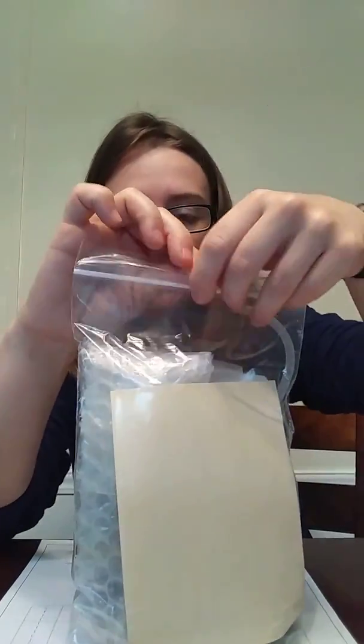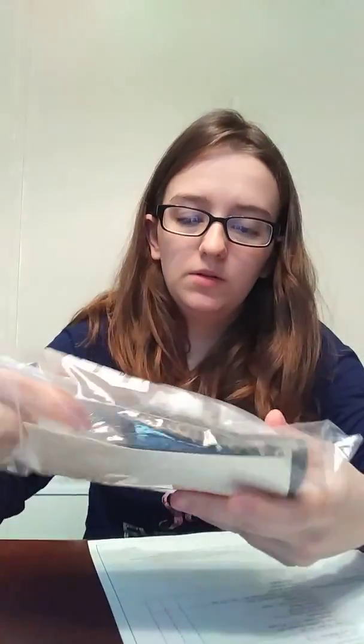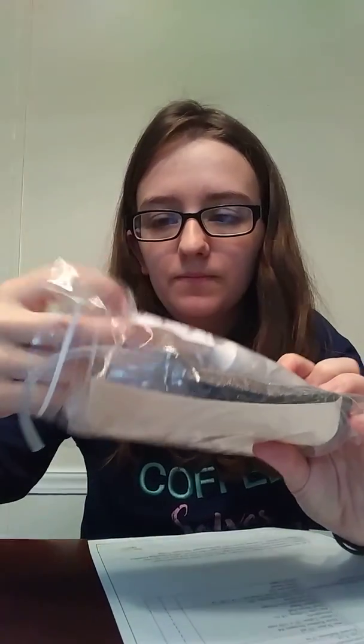Investigating chemical reactions — we have lime water, a rubber stopper, culture tubes, mini spoon, airline tubing, steel wool pad, rubber bands, dry yeast, a wood splint, and another size rubber stopper. You can actually see most of this through the bag — the dry yeast, rubber stopper, steel wool, and lime water. And 18 inches of rubber tubing — it's really flexible and soft, kind of like what I use in my aquarium fish tank tubing.